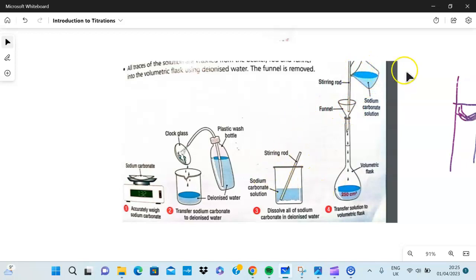Put the funnel and put this solution right in, put the stirring rod in as well, and transfer the solution. Then take this wash bottle and wash the sides of the funnel and the stirring rod. Why do we do that? Because we don't want to take any risks. It's the slightest amount that could be stuck there in the sides of the funnel and the stirring rod that's going to make a difference.